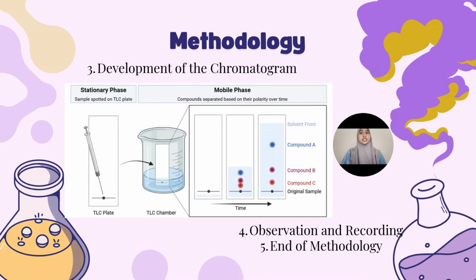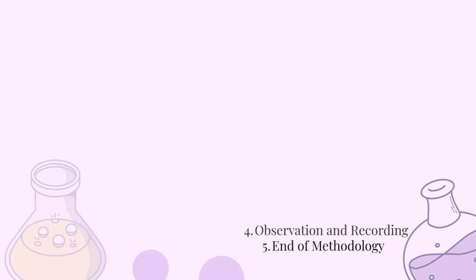In conclusion, this method successfully separated the plant pigments using paper chromatography. The separated pigment bands were then used for further discussion and analysis in this experiment.